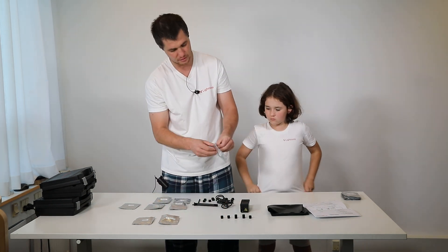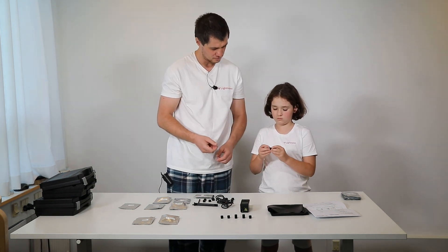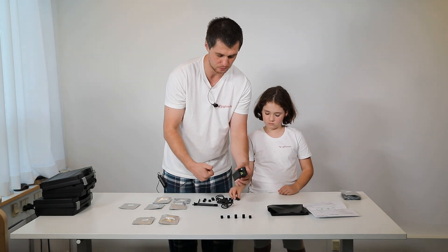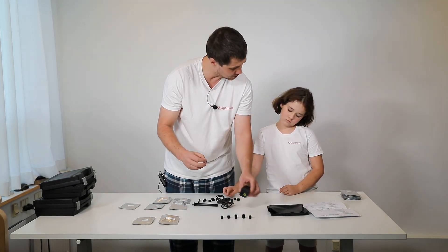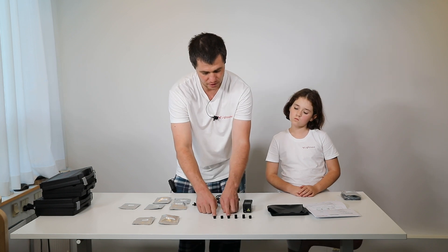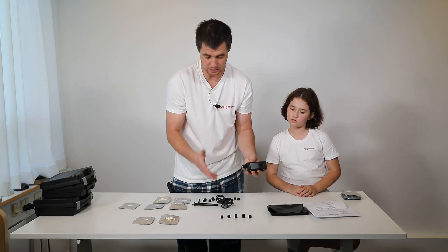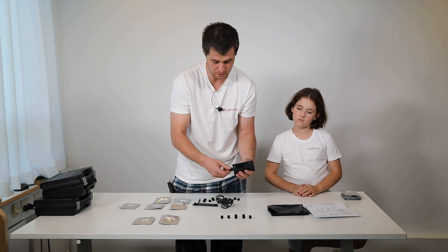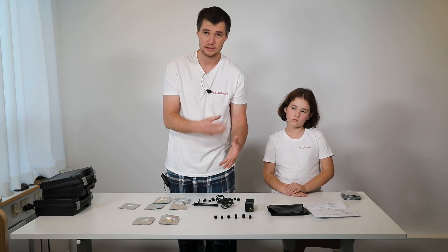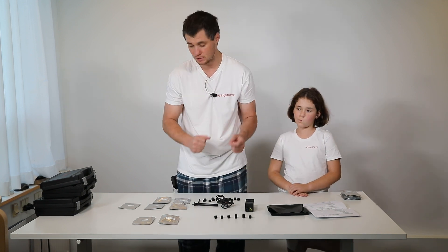The last one is the deep penetration depth probe. We attach it the same way and it will be 80 to 120 microns. This is a very interesting application — if you would like to measure penetration of some chemicals through your skin, for example. We have this as a very well-established application using three probes at different penetration depths. You can see how deep chemicals get inside the skin, or you can use it for measuring something through a plastic cover.